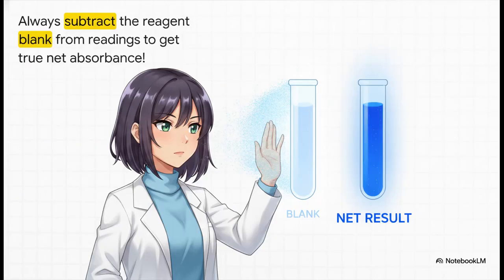But hold on. Before you draw that line and start calculating, you absolutely must follow this cardinal rule of data analysis. You have to subtract the blank. Remember standard 1, the one with absolutely no protein in it? Well, it might still show a tiny bit of absorbance just from the chemicals reacting with themselves. That's just background noise. You literally have to subtract that blank absorbance value from every single one of your other readings to get the true net absorbance. If you skip this step, you're going to artificially inflate all of your protein counts, and your data will be completely off.